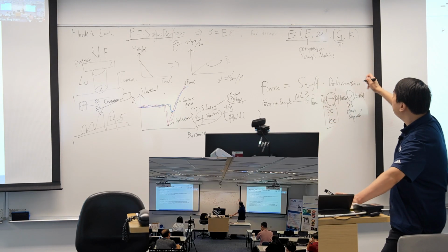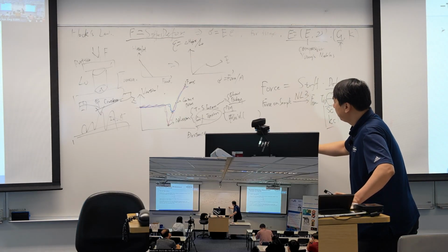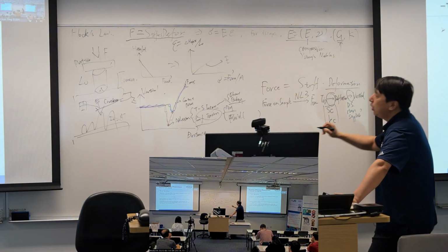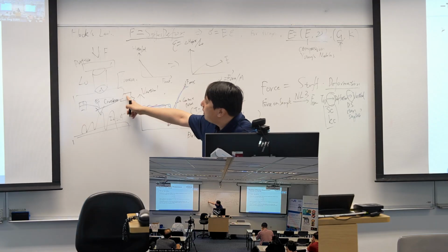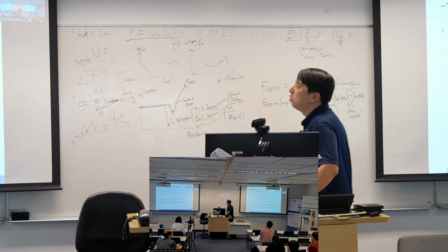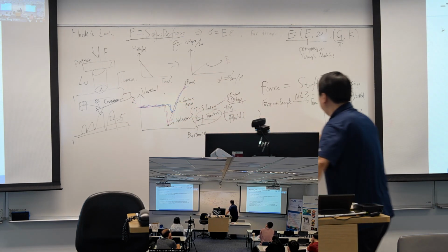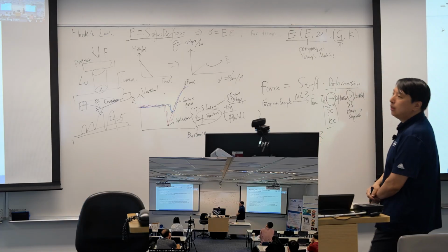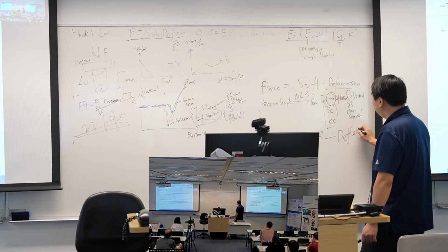And another side is the deformation. In the AFM, we are capturing the travel distance of the scanner, which is a piezo, as you all know. So this scanner movement is contributed into deflection and deformation.